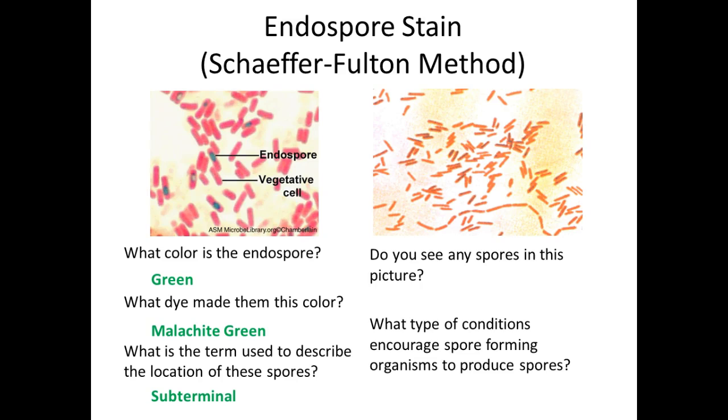The other thing is, you'll see they're teeny tiny under the microscope. You guys have already looked at bacteria, right? Being able to actually get one where it's like next to impossible mission, right? So under the microscope, I won't ask you to determine location of a spore, right? You need to be able to identify if you are in fact seeing spores, right?